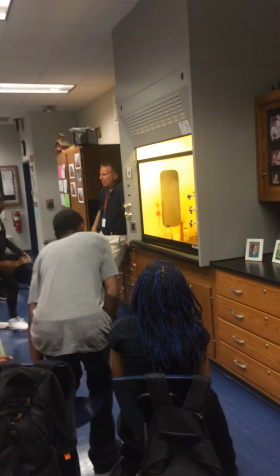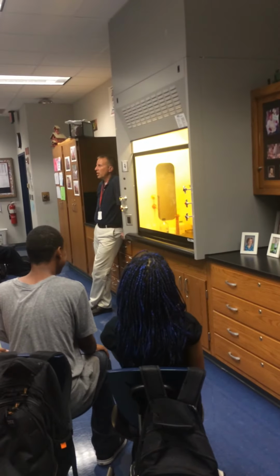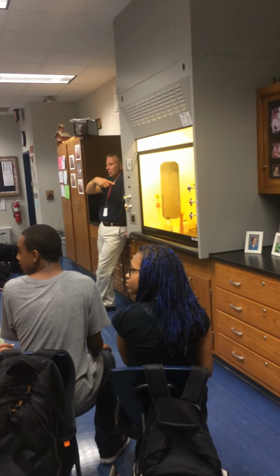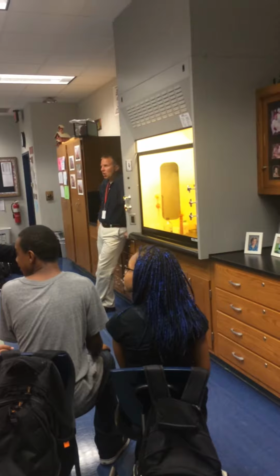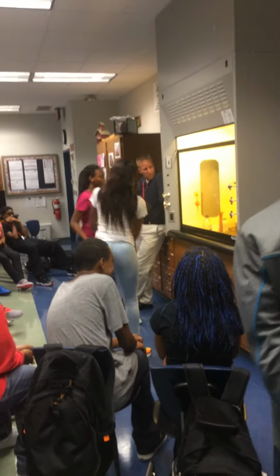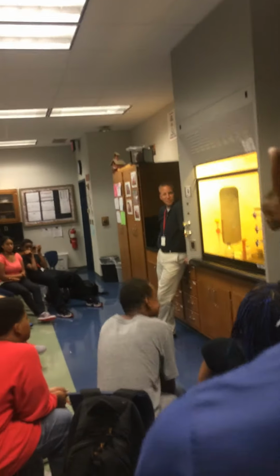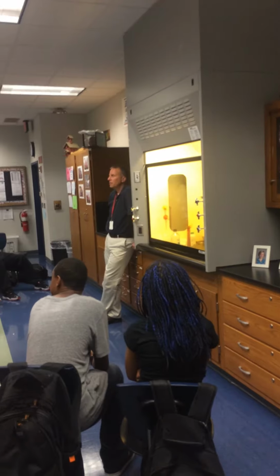You can take a look. You can walk by. Kind of a bluish green color. Can you guys see it in the back? If you want to, come up here and take a look. It's not going to bite you. Go, guys. You can go take a look. Kind of a bluish green color. Everybody good?